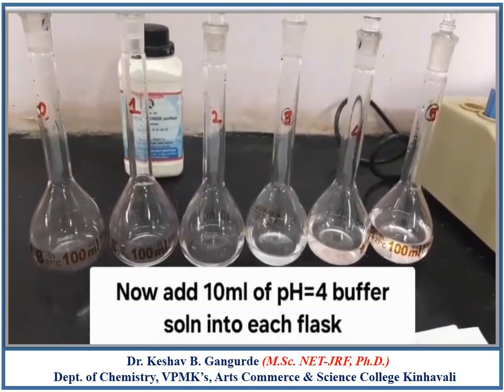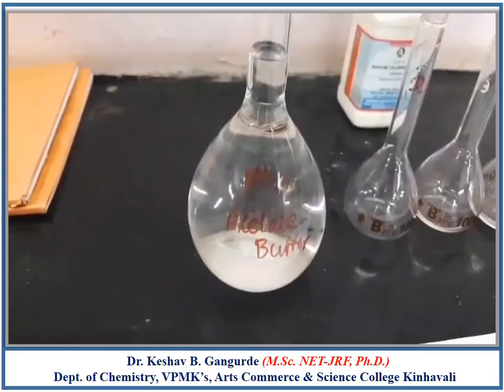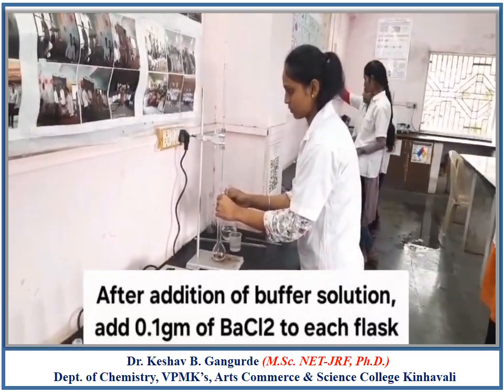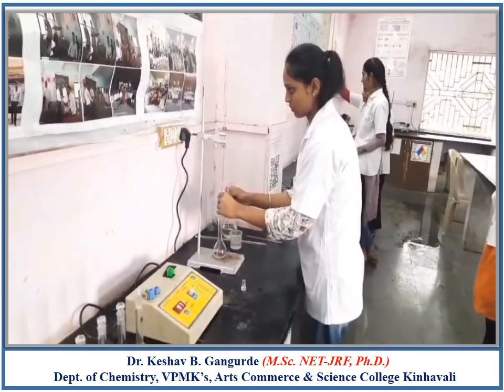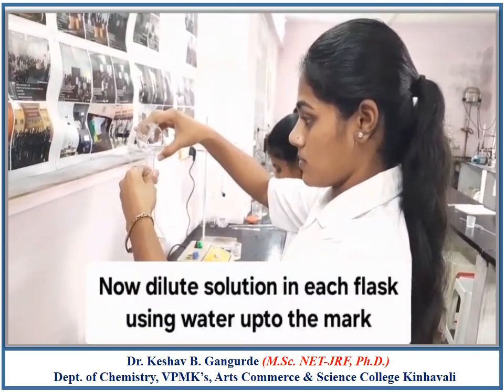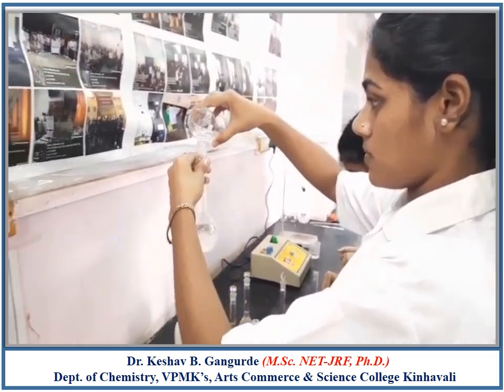To each flask, add pH 4 Buffer Solution in the volume of 10 ml. After addition of 10 ml buffer solution, add 0.1 gram of Barium Chloride. Then dilute each flask using distilled water up to the mark.